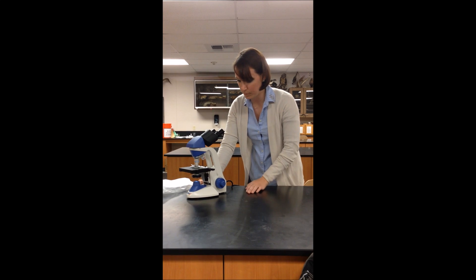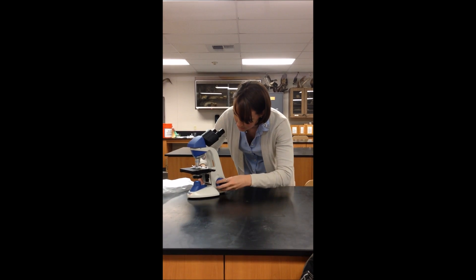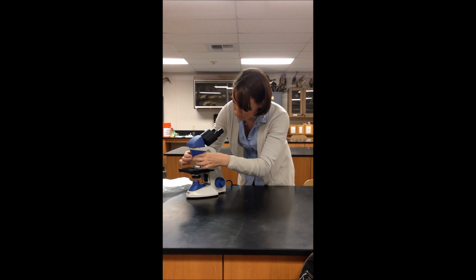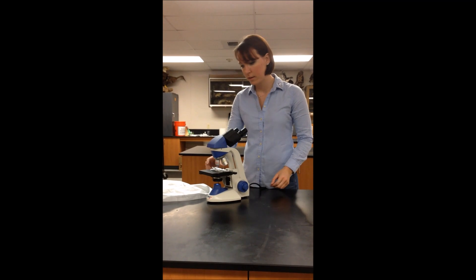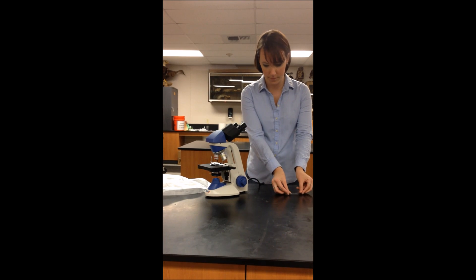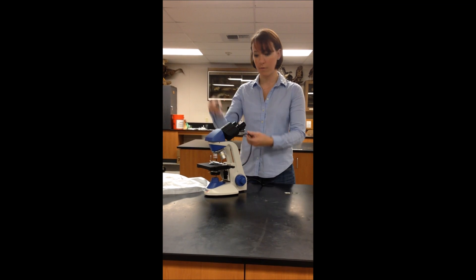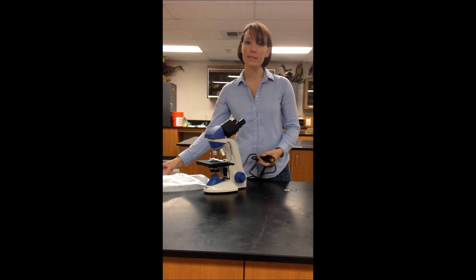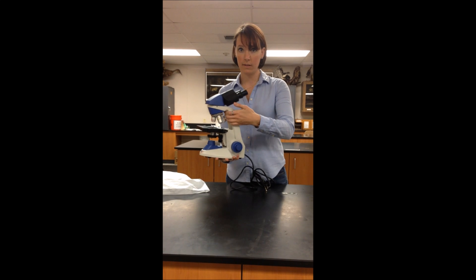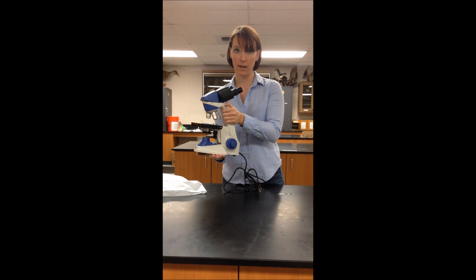Once I am done viewing my specimen, I am going to use the coarse focus to move the stage down. I am going to move the objectives back to the 4x objective for storage. So I will move the stage clip to remove the slide, turn off the scope, unplug, wrap up my cord, replace the dust cover, and put the microscope back into the cabinet using one hand underneath the microscope and one hand on the arm to carry.